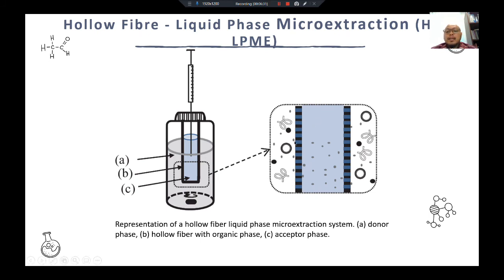Contohnya macam this is aqueous and then this is the polar non-polar extractant solvent. Okay, so kita boleh remove the interference come from polar interference. Okay, so at least we can reduce the interference. Okay, it can give us better purity of the analysis.